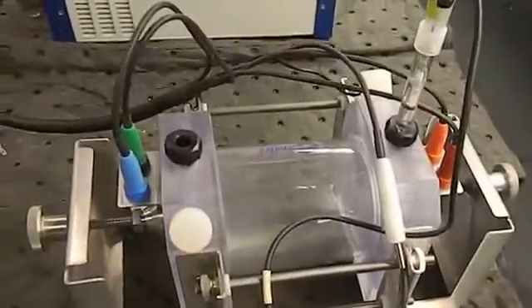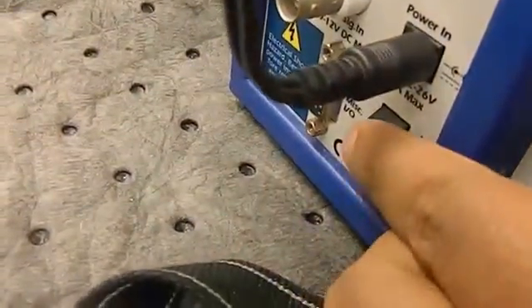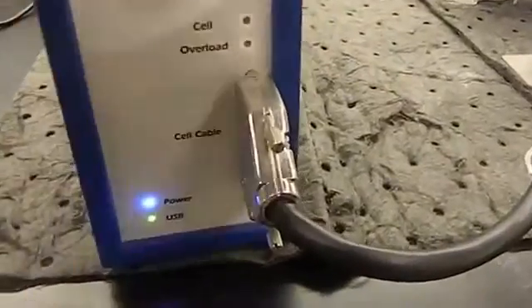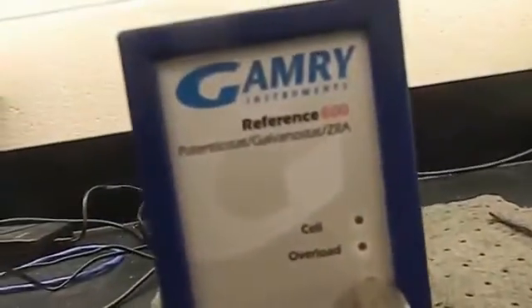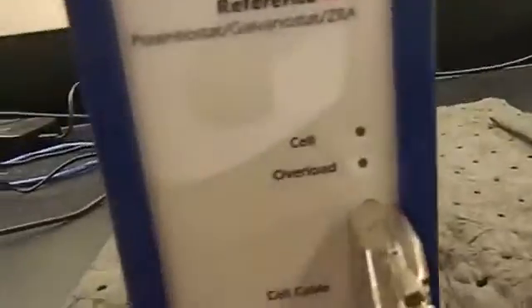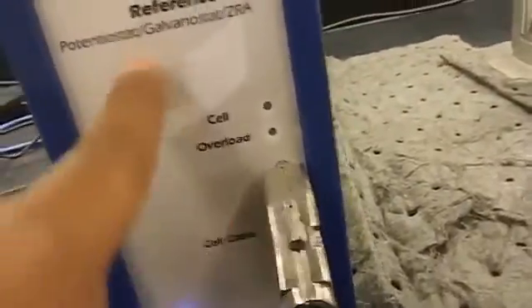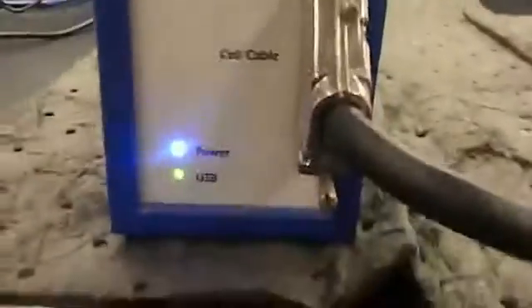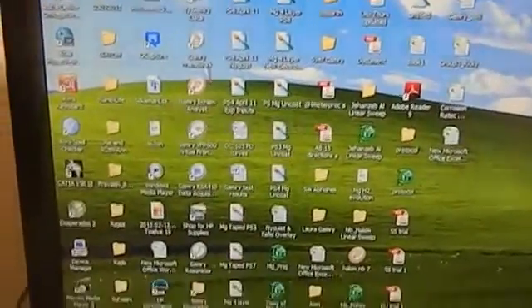This is how the cell looks — the corrosion fluid is in place. After setting it, what you have to do is turn on the GAMRI potentiostat. Here is the button — turn it on. You see the light is blue and now it has turned into green. The device is ready. USB means the computer CPU is getting data from the GAMRI, and the GAMRI device also has power, so it is ready for the work. After setting all this, we will go to GAMRI Framework.